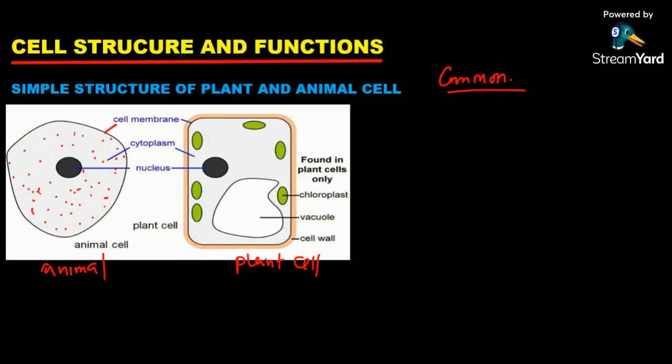Now look at the shape. In terms of shape, as we are going to look at the differences, I don't want you to miss it when you find the animal cell. In terms of the shape, you see it's irregular in shape, oval shaped, not really that. So we can just say it is irregular in shape. But look at this. This one is almost rectangle-like. Okay, rectangle-like.